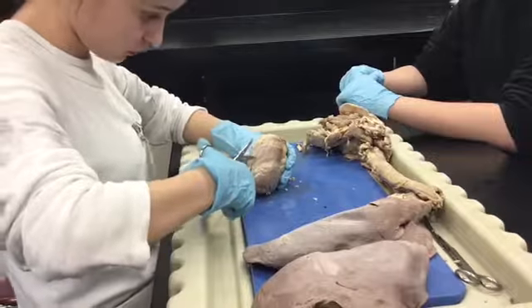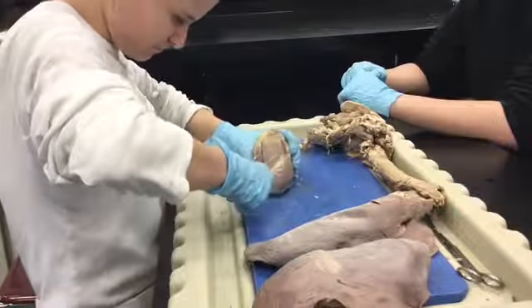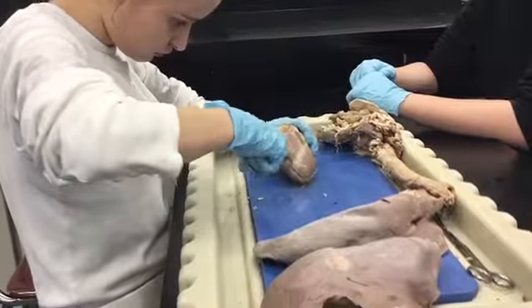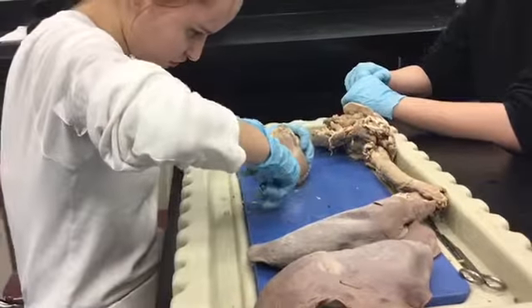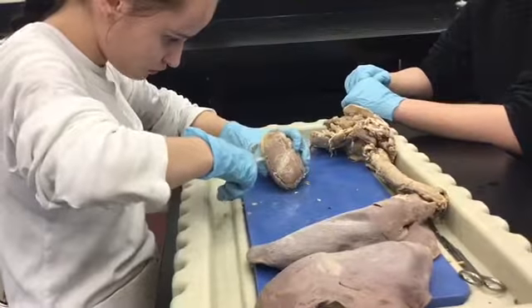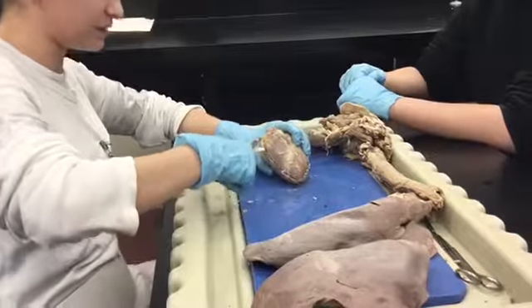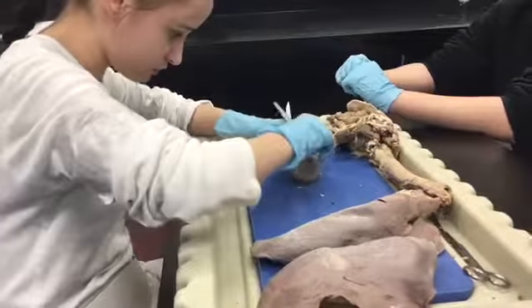This is the hardest dissection I ever did. I did cow's eyes and sheep's brain and all those type of things, but this is quite difficult. Sheep's kidney, I think. Yeah. Videos on the channel, that nonsense. A lot of people, my teachers and my family, say I should be a coroner. I'm like, I don't think I have the guts to do it. I think this is the biggest organism I ever dissected.